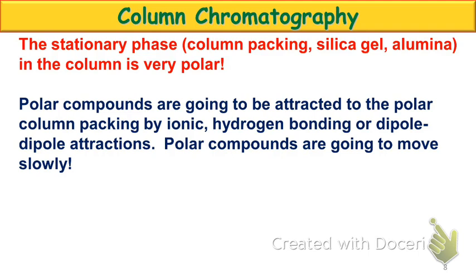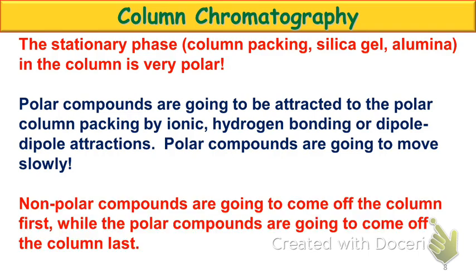Okay. Where does the compound come out? Comes out at the bottom. Which compound comes off last? The most polar. The most polar, which is my pinky, which for some reason is tweaking out right now. Okay? The most polar compound is going to stick to the column, and it's going to take longer to come off the column. Okay? So it'll travel more slowly. Non-polar compounds, conversely, didn't stick to the TLC plate. They aren't going to stick within the column, and they're going to flow right off of that really, really fast. Okay?